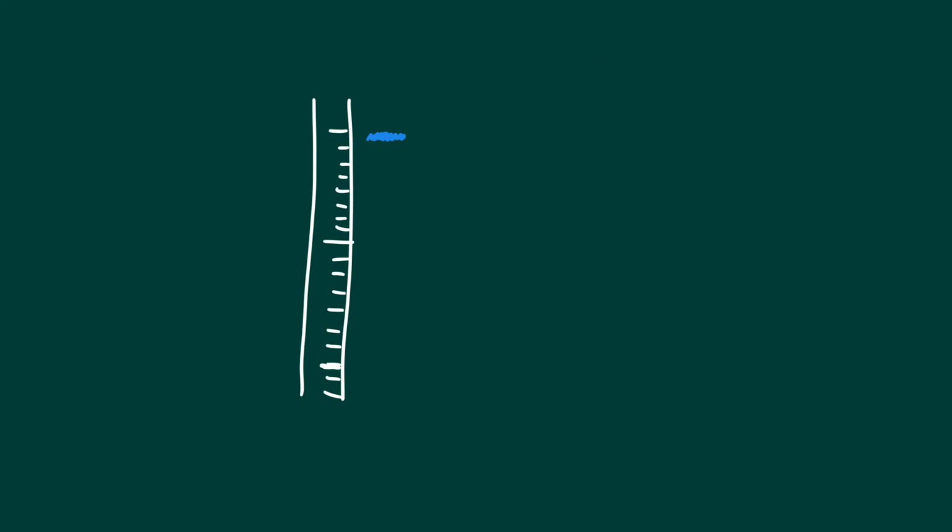Okay, so let's just talk a little bit about measuring the liquid level in the pipette tube. So what's going to happen is liquid is going to be pushed down by CO2 forming in the fermenter, and it's really all about the rate of this liquid level dropping, because that will tell you how fast they are producing energy from sugar. Okay, so if you have a growth experiment, you might find that your volumetric rates, remember it's all about the delta V divided by the delta T, can go in excess of 10 milliliters per minute. Okay, so basically if you've got a 50 milliliter pipette, in 5 minutes the whole volume will be displaced.